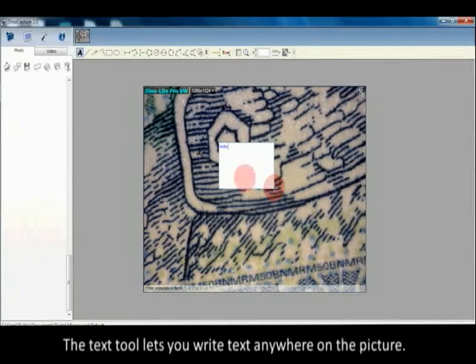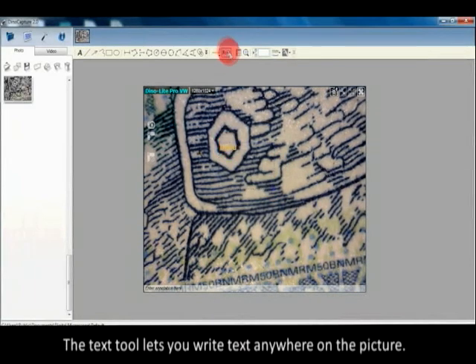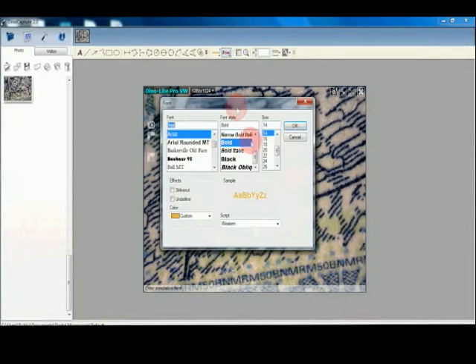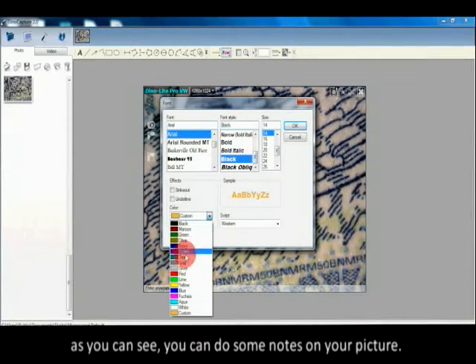The text tool lets you write text anywhere on the picture. As you can see, you can add notes to your picture.